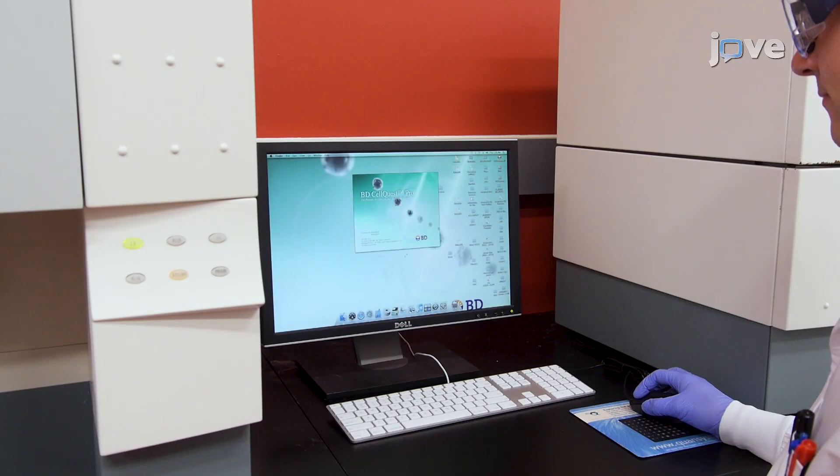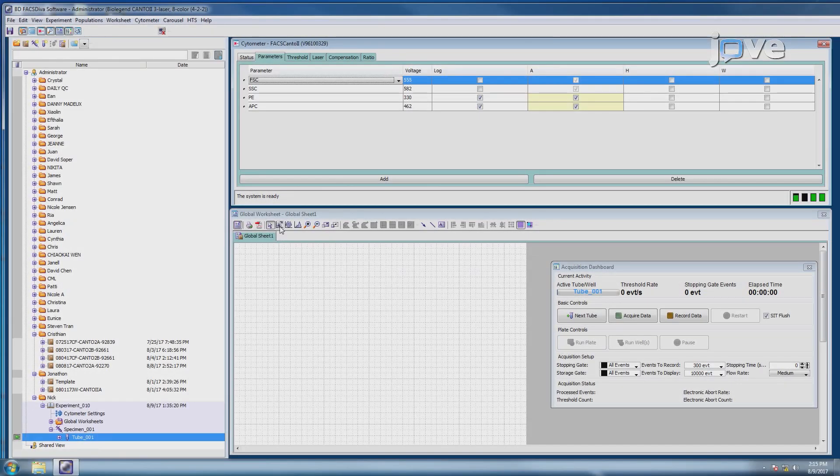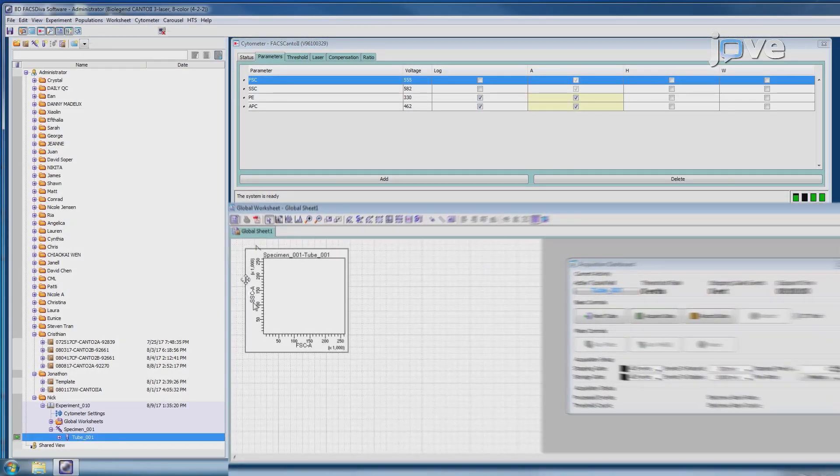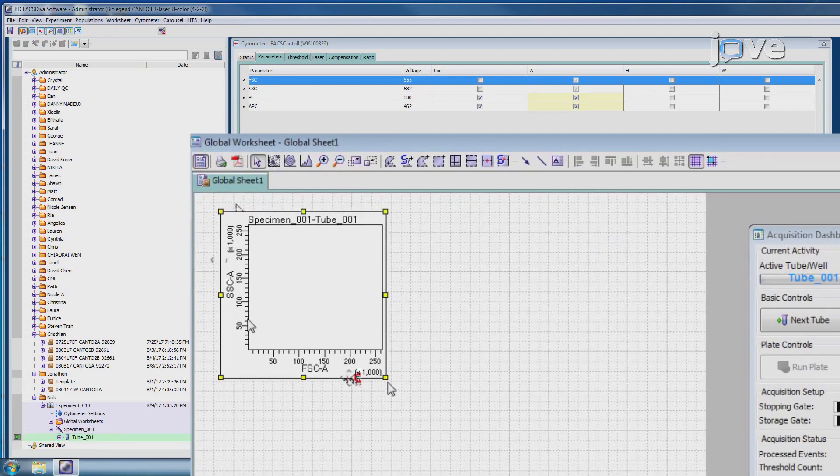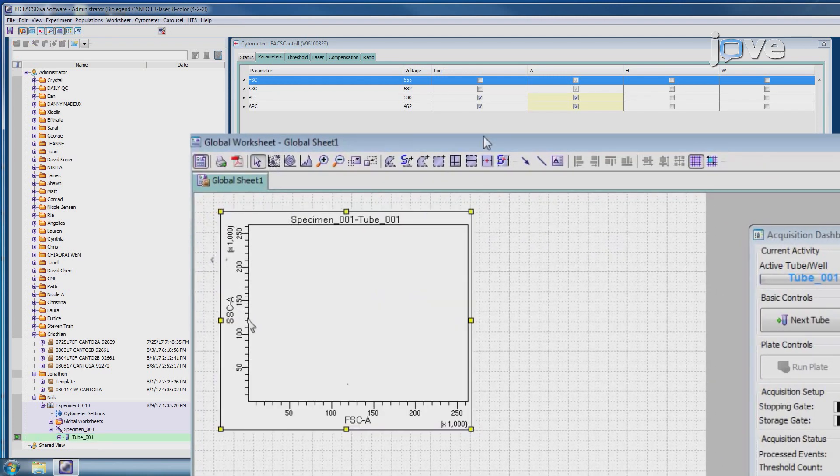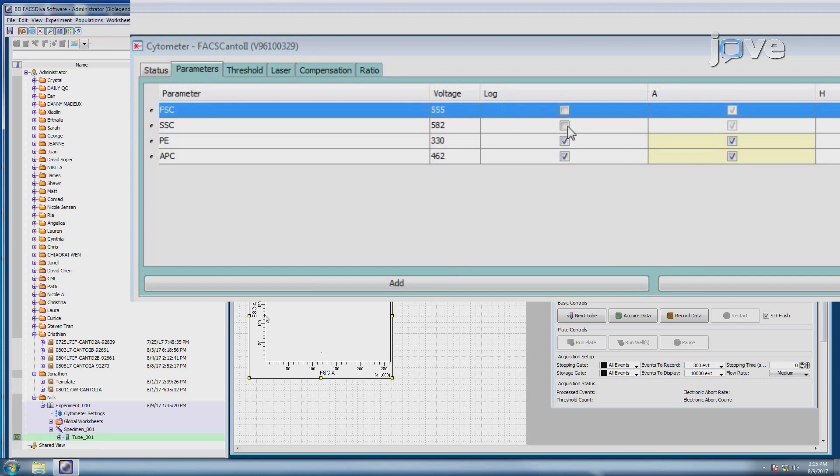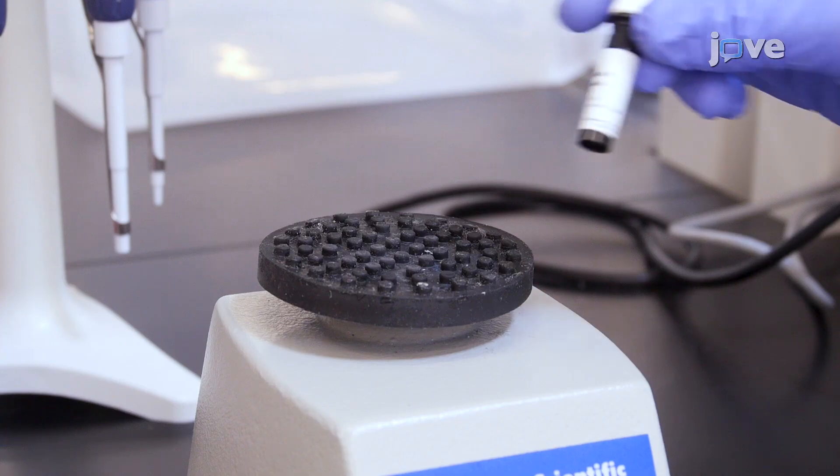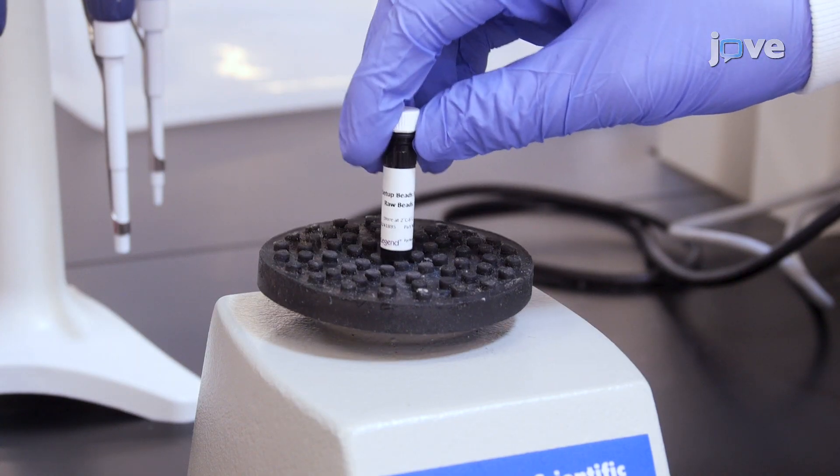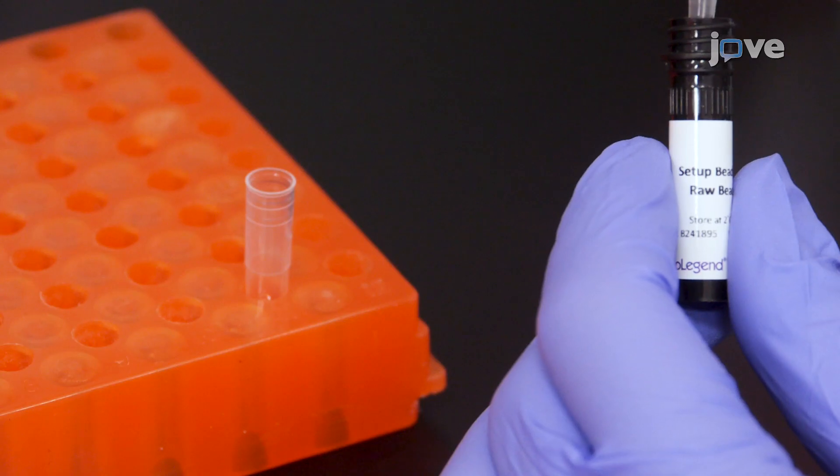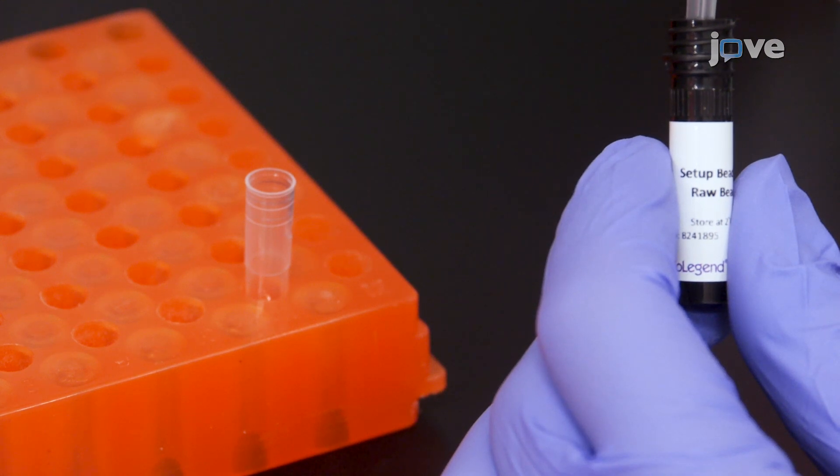Start up the flow cytometer and acquisition software according to the manufacturer's instructions provided with the instrument. Create a dot plot with forward scatter on the x-axis and side scatter for the y-axis. Set forward scatter and side scatter to linear mode. Vortex the vial of raw beads included in the kit for 30 seconds to resuspend the beads. Transfer 400 microliters of the raw beads to a new FACS tube.